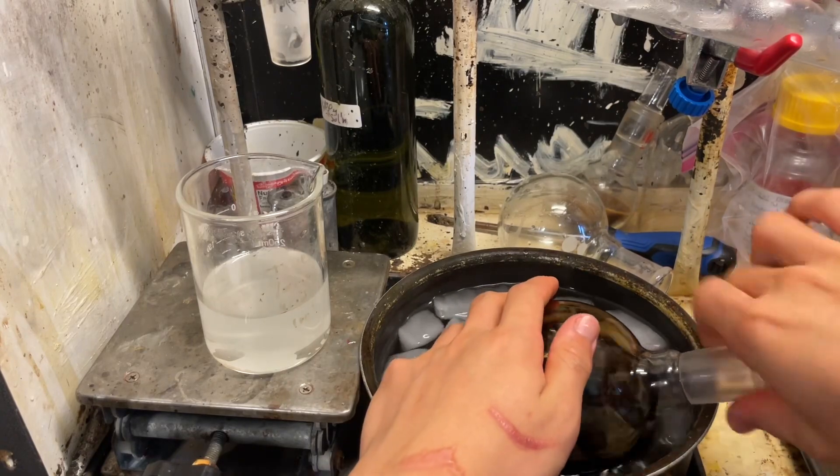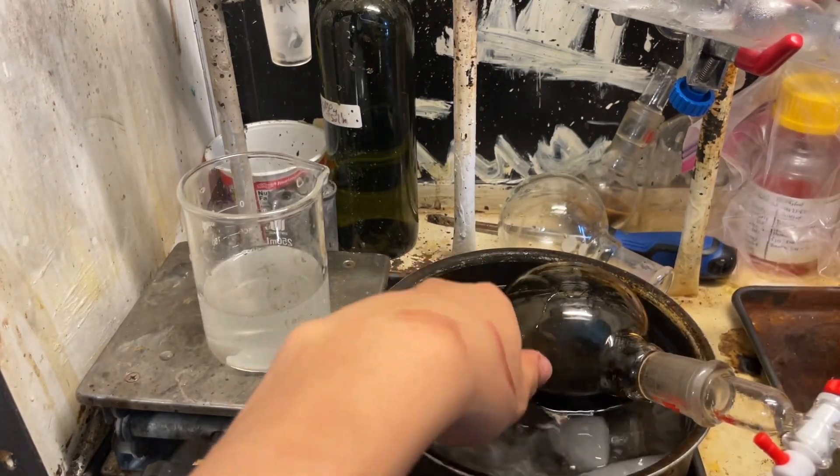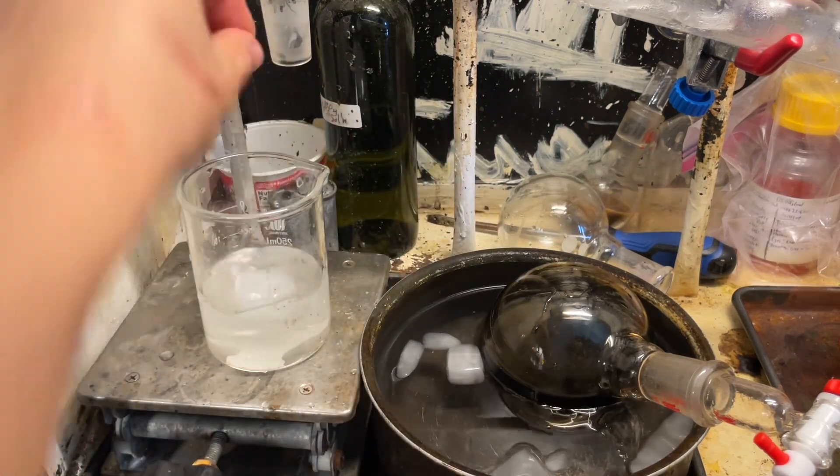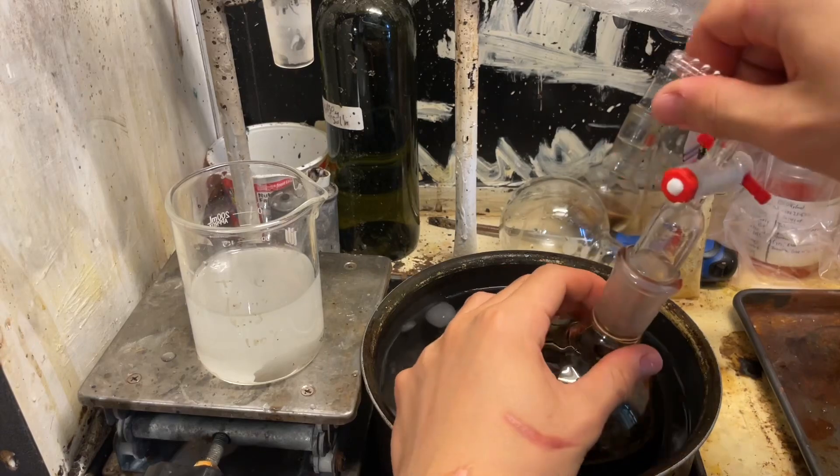Still violent. Cool this down. You know what, I'll put an ice cube in — we're going to steam-distill it anyway, so it doesn't matter. Some water is in our sodium hydroxide solution. Let's try it now.